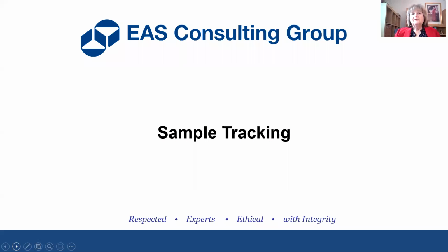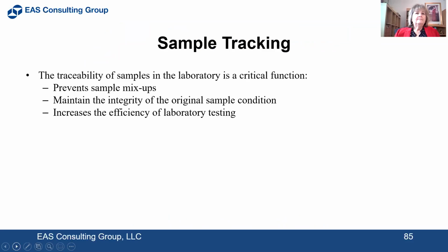Now we'll go over sample tracking in the laboratory. Traceability of samples in the laboratory is a critical function. It prevents sample mix-ups. It maintains the integrity of the original sample condition, and it increases the efficiency in laboratory testing.